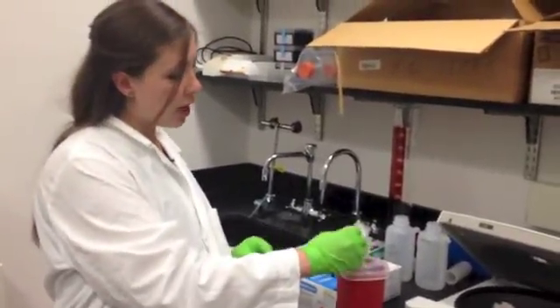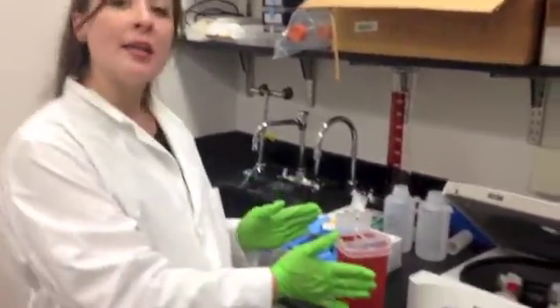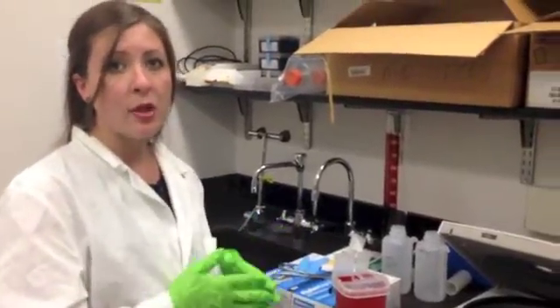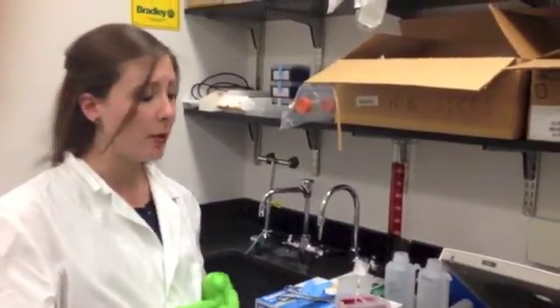With a sharps bin, you want to make sure that you have the correct size for the amount of sharps you're going to be working with, and the correct number in case you need multiple sharps bins. That's the kind of forward planning that you need to do with each experiment.